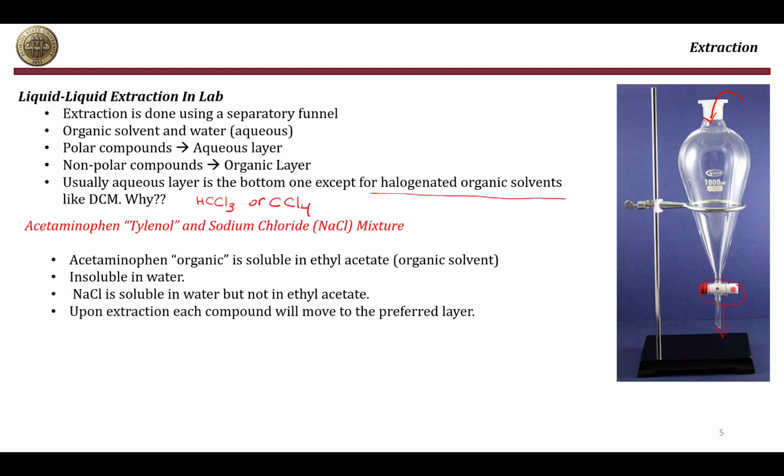Based on that, upon extraction, if I add those two solvents, this is the aqueous layer, so water is here, and this is the organic layer, so ethyl acetate, which is the organic solvent, is here. Acetaminophen, which is an organic compound, will prefer to stay in this layer, whereas sodium chloride, which has high affinity to water, will stay in the water layer.